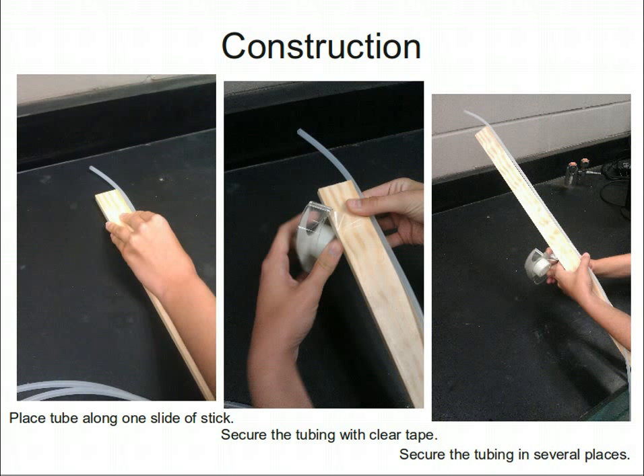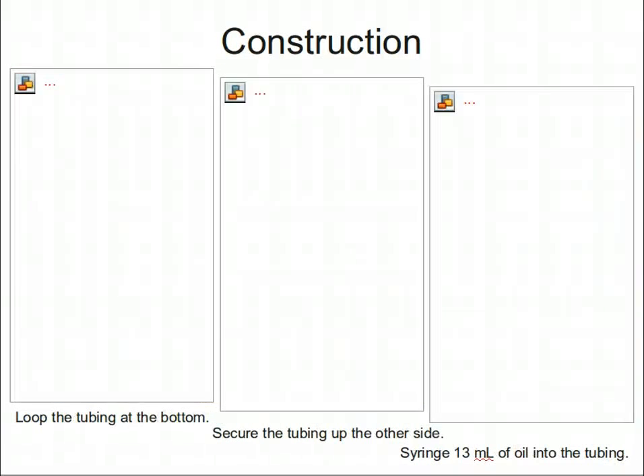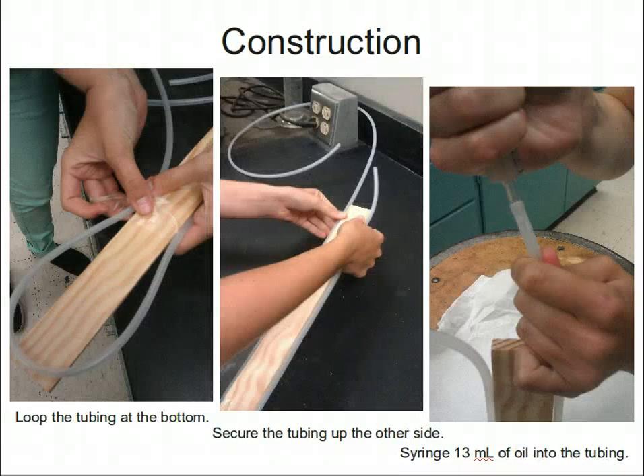The construction of the manometer is very simple. Place one end of the tubing just slightly above the top of the stick and run it along the side, securing it in several places with clear tape. Near the very bottom of the stick, loop the tubing taking care not to crimp it, then run the tubing back up the stick again, using clear tape to secure it along the side.